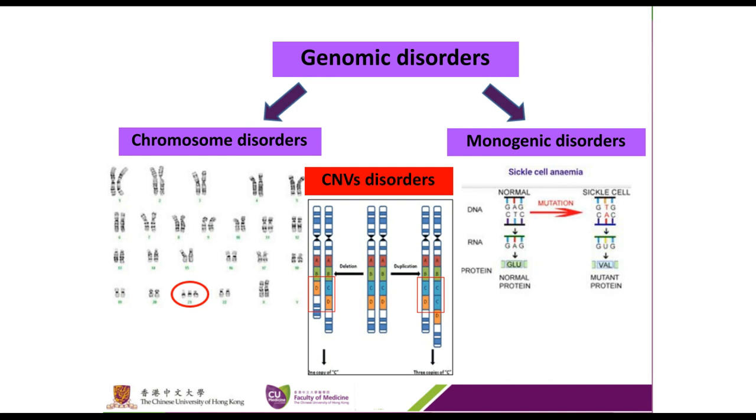But now that's not enough, because we know that there's a new group of copy-number variant disorders. They could be like what I highlight in the box. It could be a deletion of a small region, or it could be a duplication of a small region, like there's duplication of the blue C square. And for this, we need a different method, which is the microarray.